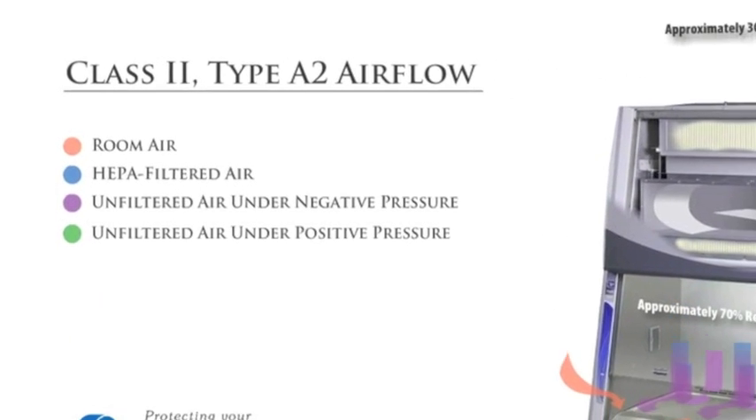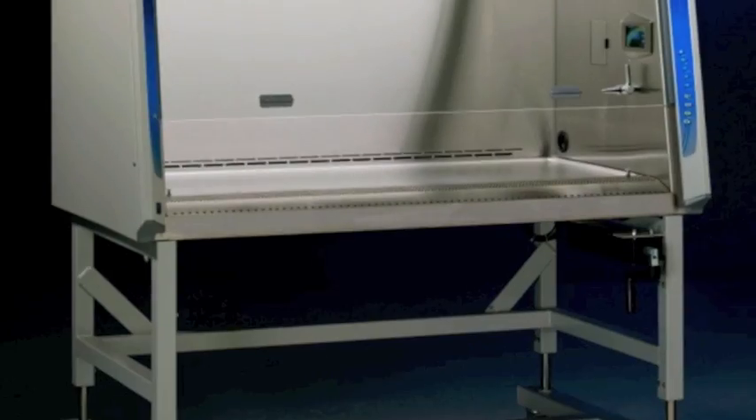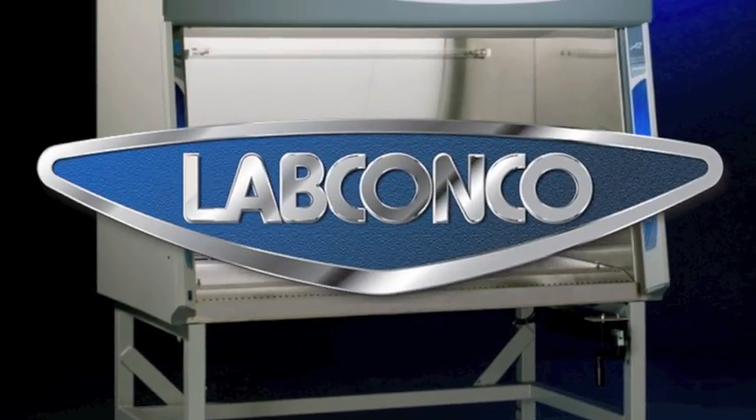This video will demonstrate the airflow within a Class 2 Type A2 Purifier Logic Plus Biological Safety Cabinet.